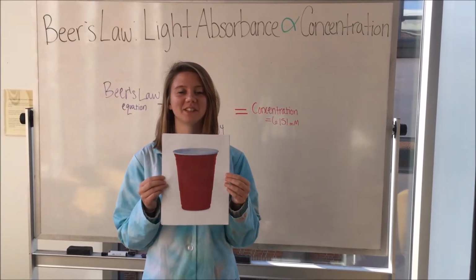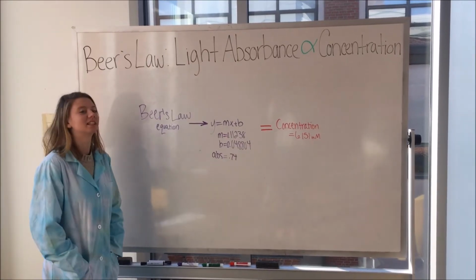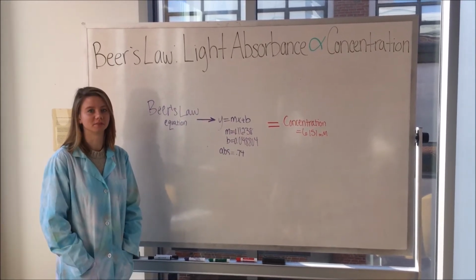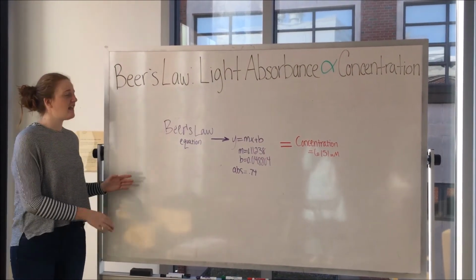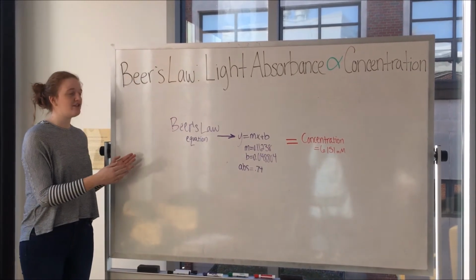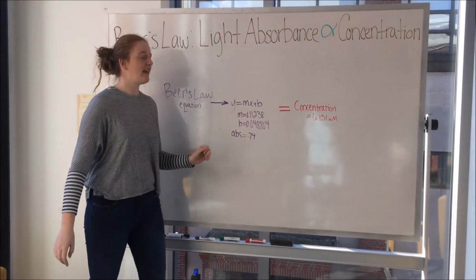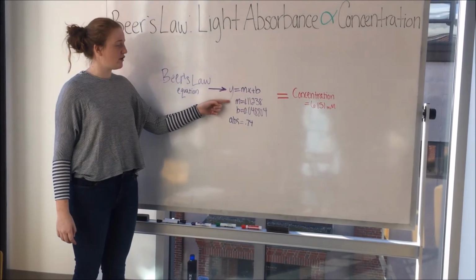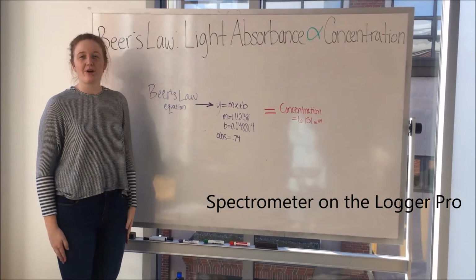In the lab, we used Beer's law. Beer's law states that the light absorbance of our solution is directly proportional to the concentration of the solution. In class, we took concentrations of known solutions and used Beer's law to measure the light absorbance with the Logger Pro of each solution. We then used Beer's law and found the unknown concentration of our nanoparticles using the slope, the y-intercept, and the absorbance given to us on the Logger Pro.